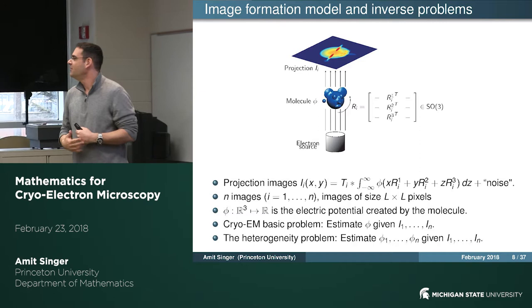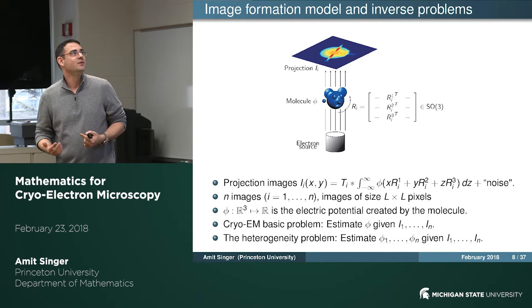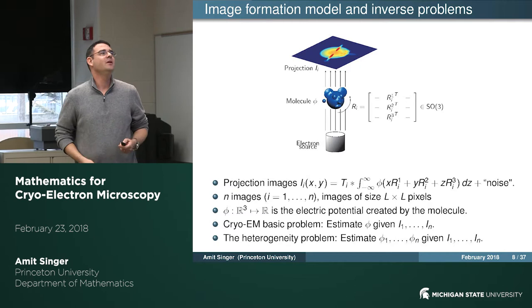So the cryo EM problem from a mathematical perspective is an inverse problem. And in order to discuss a method to solve the problem, first I need to discuss what the image formation model is, what the forward model is. So I already mentioned it, but you just have to put it in some equations.